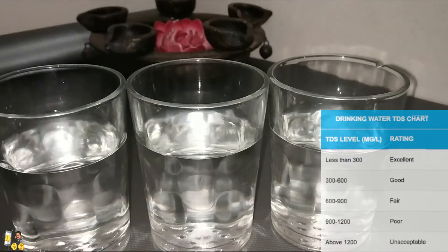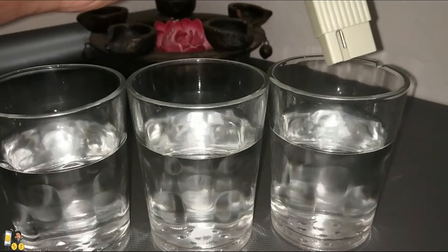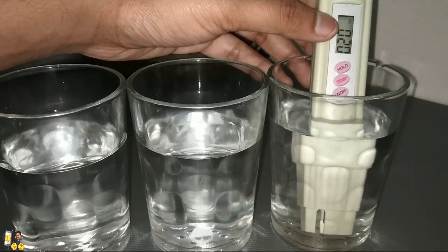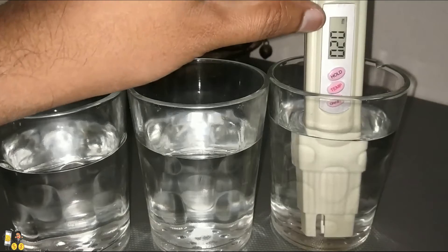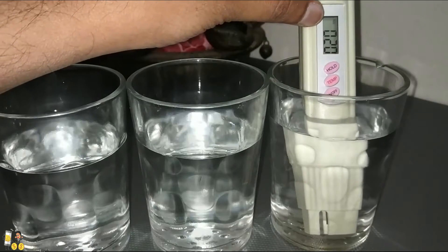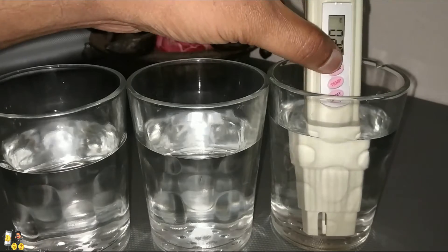Now we are going to clean it before placing it in the RO filter water. Here you can see I have cleaned it. We are going to keep it inside the RO filtered water. The RO filtered water reads 20 PPM — this water level is perfect for drinking. You can press the hold button to save the reading.